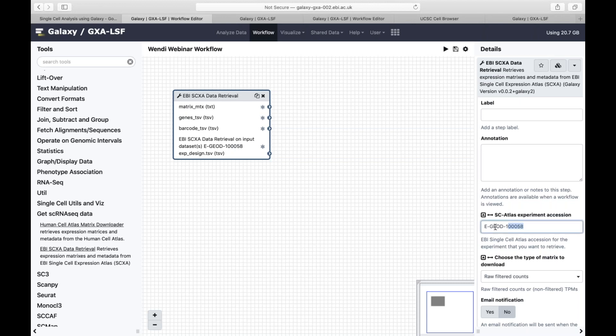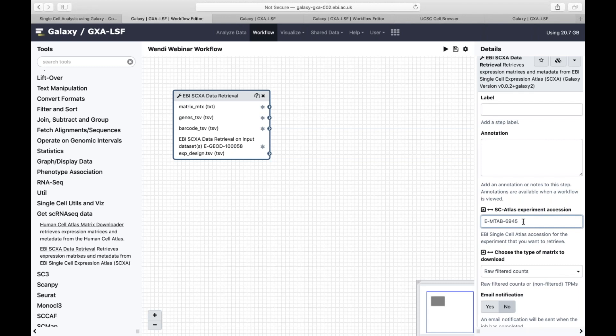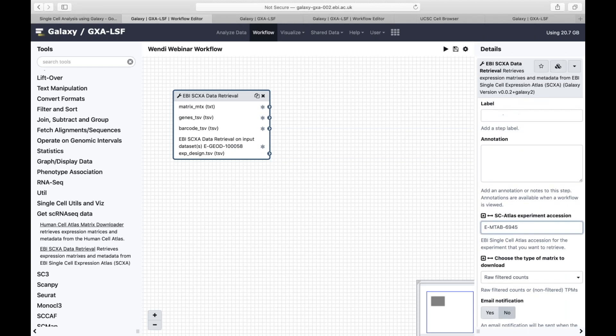The data I'm going to use is from my actual postdoc, because when I first came here and saw the Galaxy pipeline, I plugged in data I'd slaved over for months and was able to redo what had taken me months to understand in about 20 minutes — which was both exciting and a little bittersweet. The accession number is what you can find when looking at datasets in the Single Cell Expression Atlas. There was also a great webinar on that a couple of weeks ago.